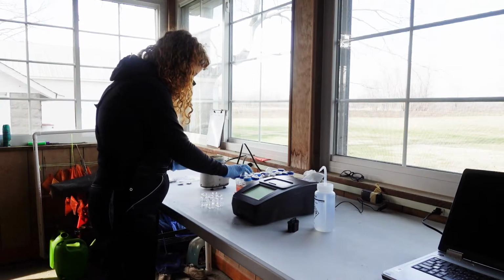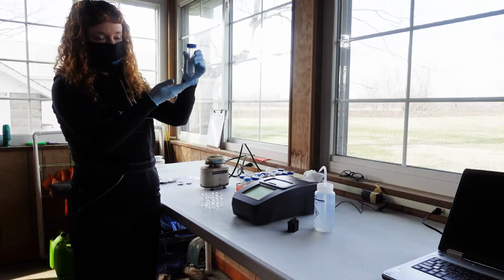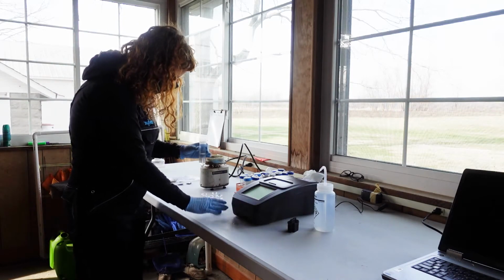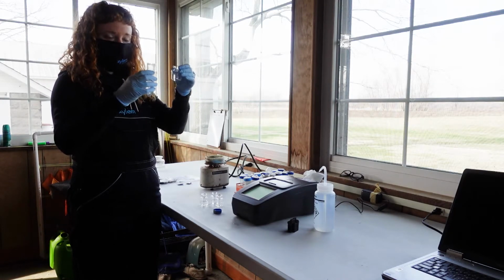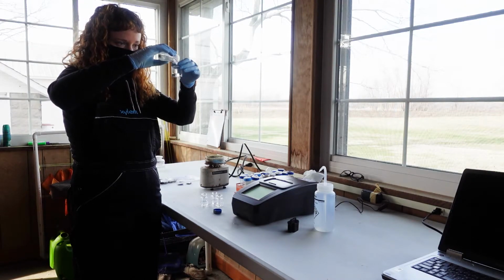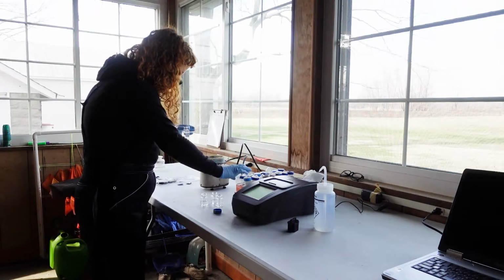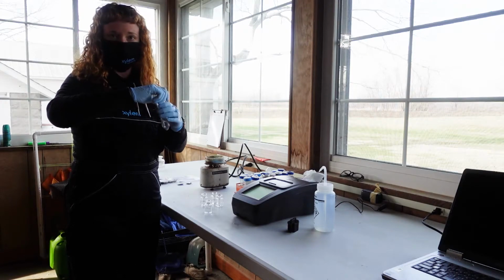The first thing I will do is take my 0N tube. Remember, it had 25 mils. It's reactive. The reagent is at the bottom. All right? Now this is important. I have 25 milliliters in here, but my cuvette is only 10 milliliters. We do this on purpose. What I'm going to do is decant from the top. So I will pour up to about 10 milliliters, making sure to not pour out the reagent in the bottom. We don't need that. It doesn't have anything that we need to read, and in fact, the reagent and the turbidity can interfere with the measurement.